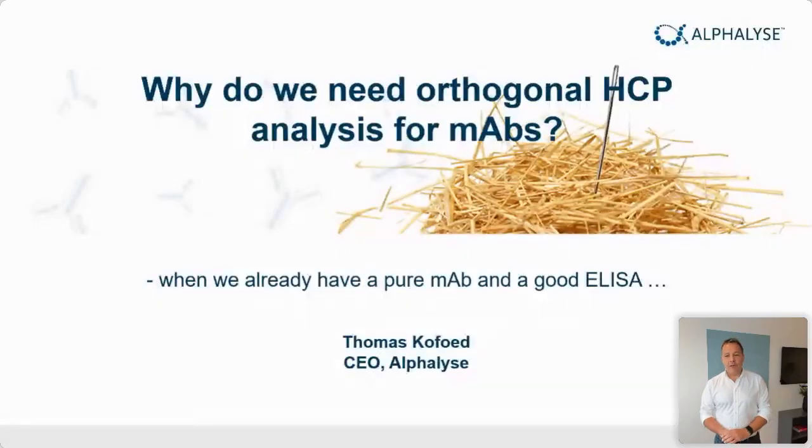Yes, thank you. I also like to thank you for joining in today. As you can see, the presentation title is a question, and this is a question we get quite often from our clients. Why do we need an orthogonal HCP analysis for monoclonal antibodies? We already have quite pure monoclonal antibody, and we have quite good ELISA for monitoring the host cell proteins.